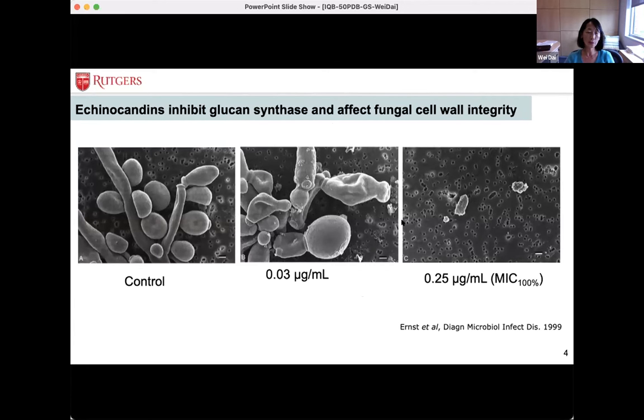If we use, for example, caspofungin to treat Candida species, we can see very obviously they show inhibition of growth and also the whole cell shows deformed cell wall. At higher concentration, 100% minimal inhibitory concentration, you actually can see there are only cellular debris left, suggesting both the cell membrane and also the cell wall structure are completely destroyed.